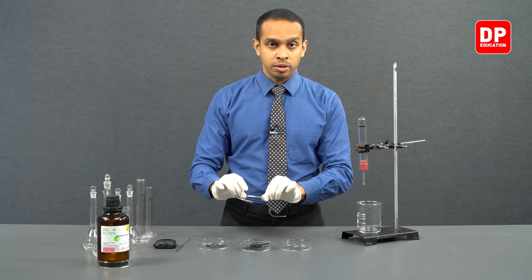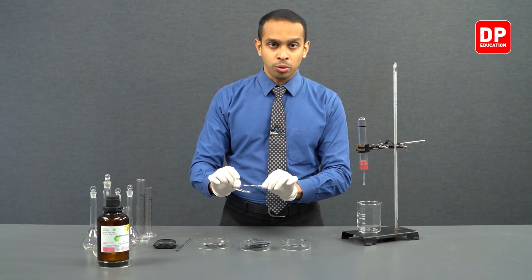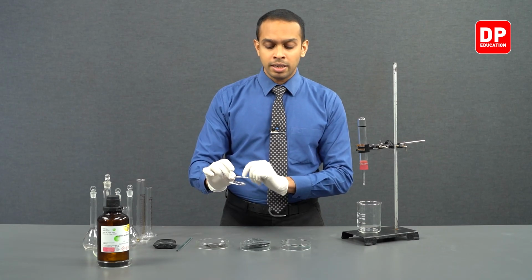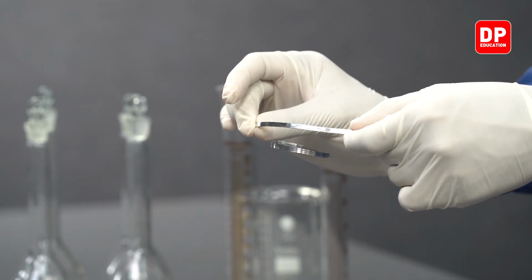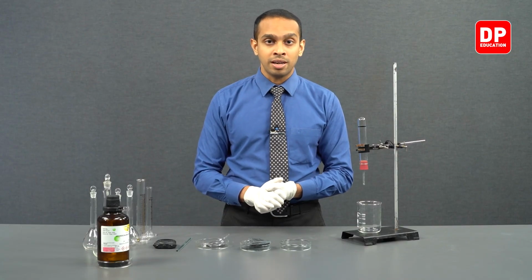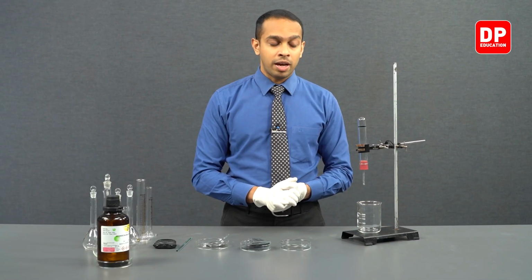And you have to make sure when you are using magnesium for this experiment or any other experiment, you have to strip off the outer coating with the use of a sandpaper and obtain your magnesium like this. Right? You have to make sure the magnesium strip that you are using is not dull in its color.